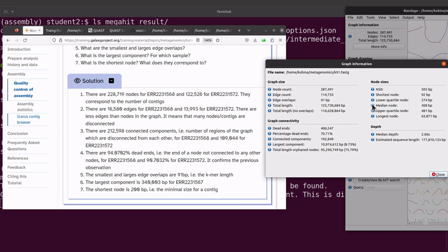So there are differences. If you compare the answers here to what we have, some of the values are different. This could be due to a number of factors that could lead to the differences in the results. Nevertheless, what we've done was to follow the best practices to get our data. So hopefully, if you follow these steps, you should be able to get results that are good and reproducible.